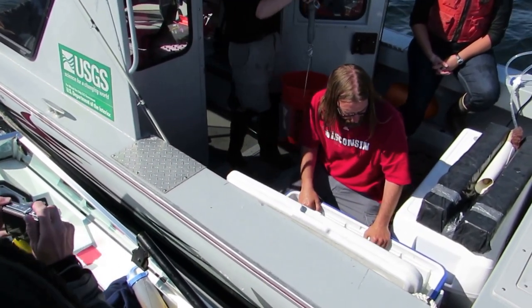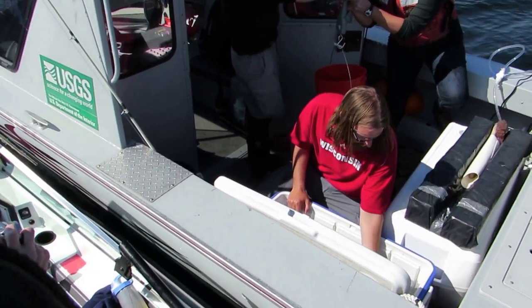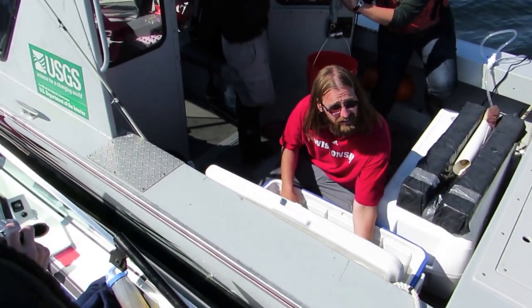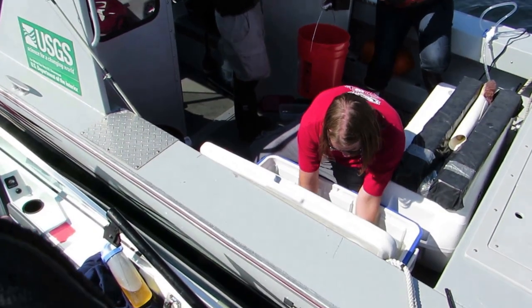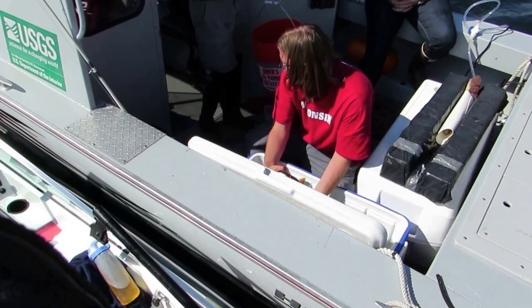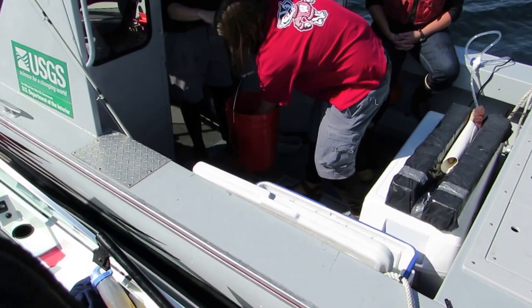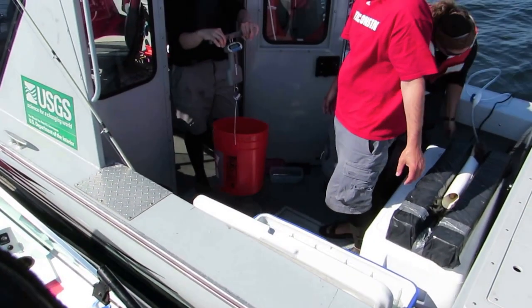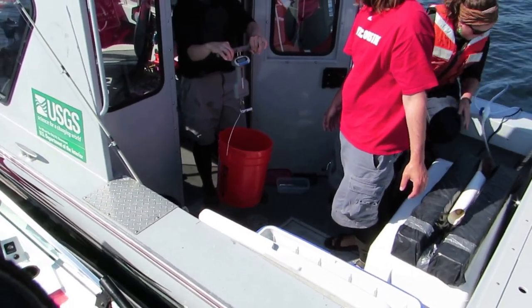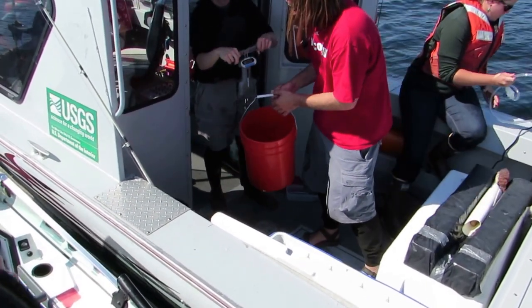Now we're going to try and get a weight on them. We place them in the bucket and we have 3.44 pounds.